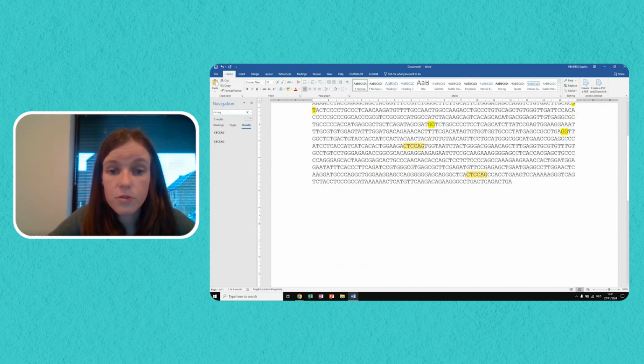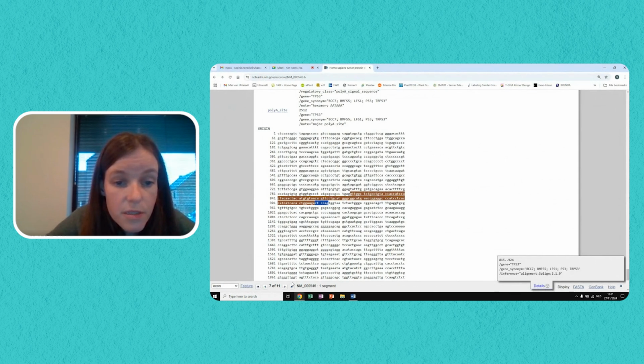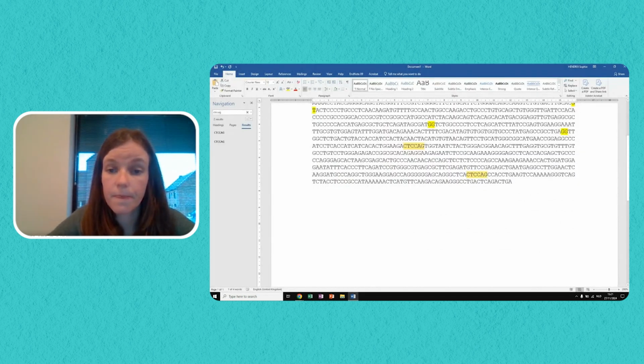I found this twice. So then I will just double check. I think it will be this one. So here the letters in front of it are GA, whereas here it is CA. But on this page, it's indeed GA. So this means that this was the correct sequence. So that the next exon boundary is located here.